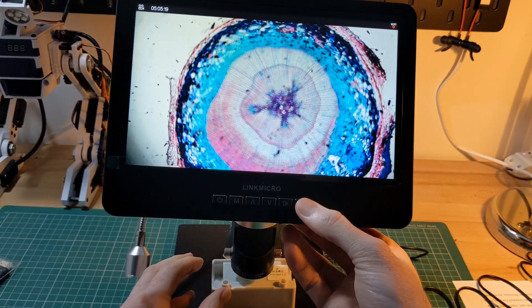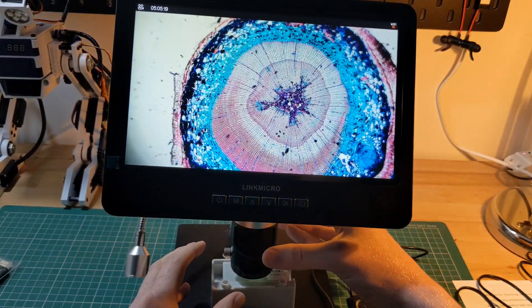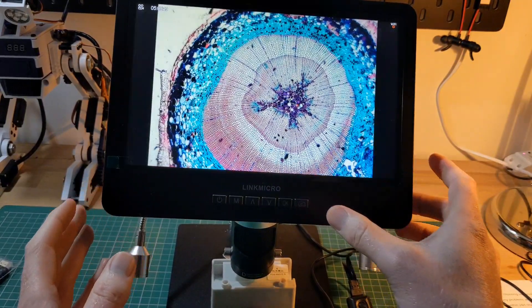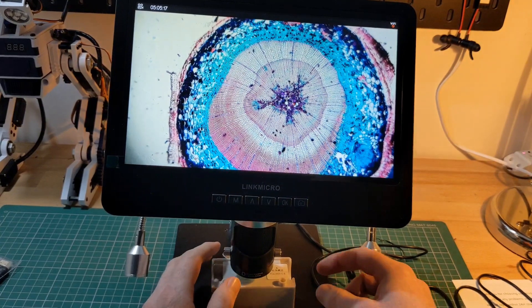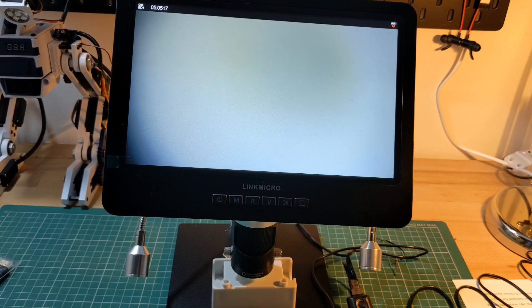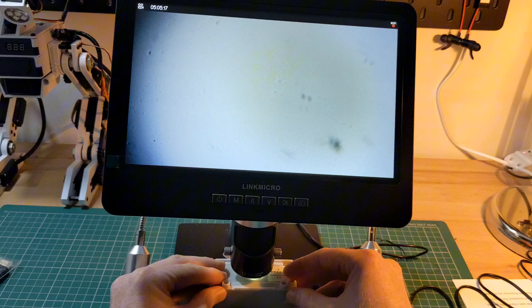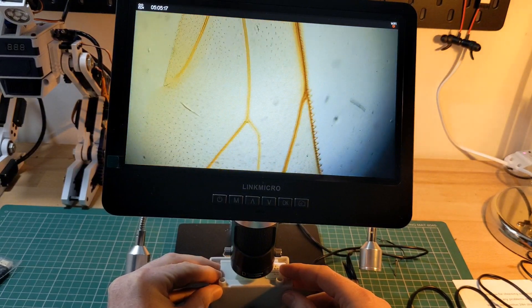This is a pine stem cross section, and you can see the detail is incredible. The second slide is a bee wing. What looks like the individual hairs are clearly visible.